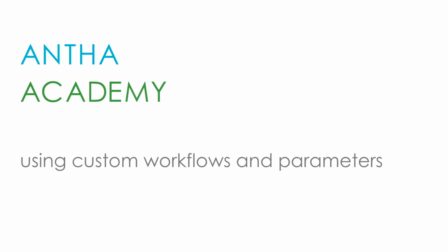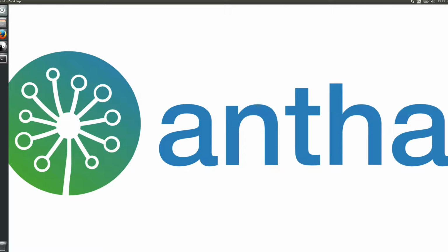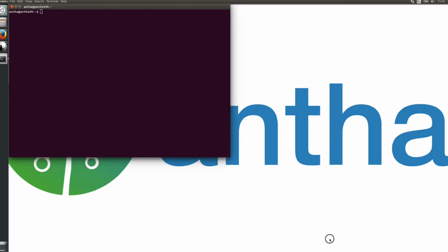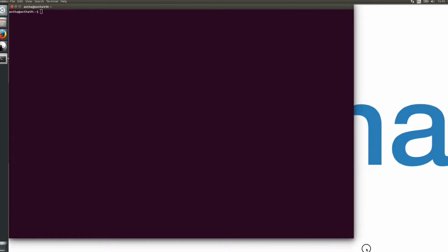In the last video, we walked around the Antha workflow directories and got some practice using terminal commands. You may recall that some of those directories contained more than one parameters and workflow file. In this video, we're going to take a look at how to change the parameters and workflow files which go into an experiment when using the Antha run command.